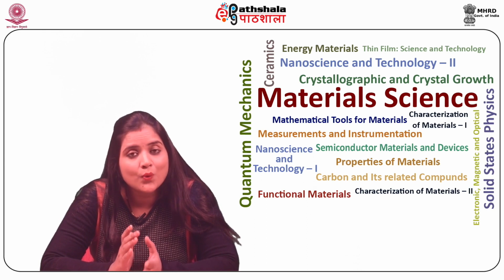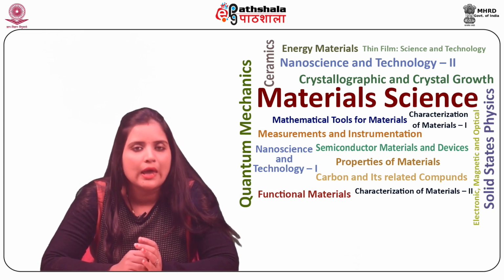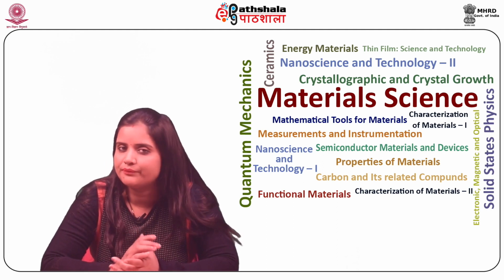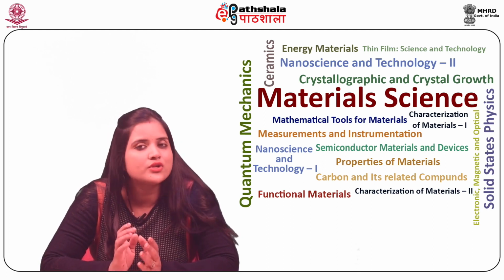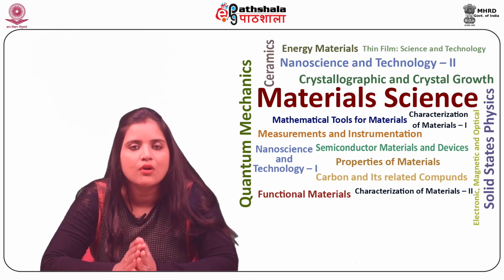Now, moving on to the disadvantages of STM. STMs are complex to operate effectively. It is a highly specific technique which requires great skill and precision.